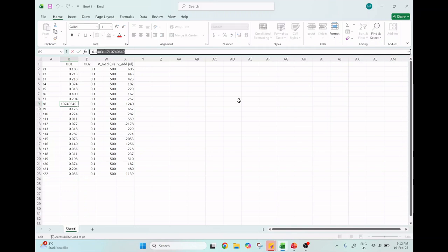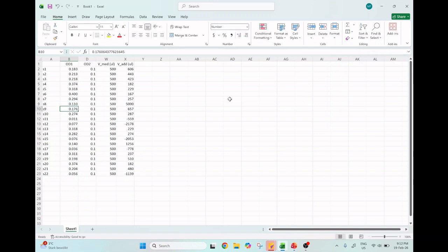So let's say the OD that we measured was 0.11. And then you see that you may have to, for example, take 5 milliliters here. And then if you want to do this dilution in, let's say, a 2 milliliter tube, well, then you have a problem. Or it could also be that you don't even have this much volume, so you don't have 5 milliliters of your solution that you want to dilute.